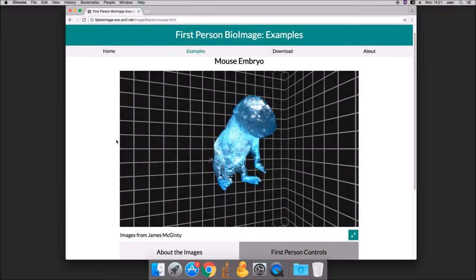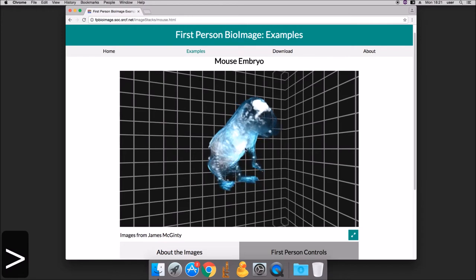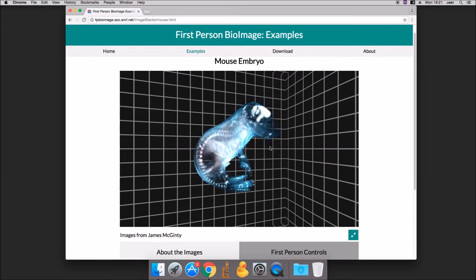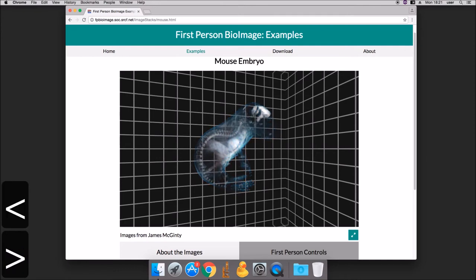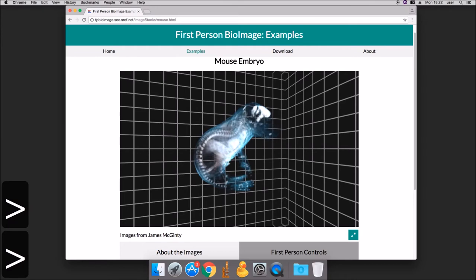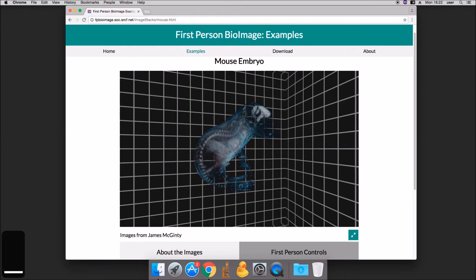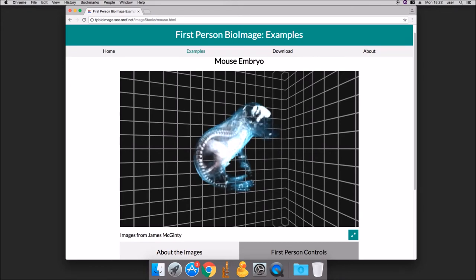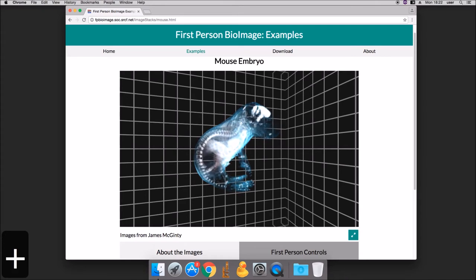The opacity of the model can be changed using the greater than and less than keys. The colour intensity can be decreased or increased using minus and plus. The rendering threshold can be changed using the curly braces.